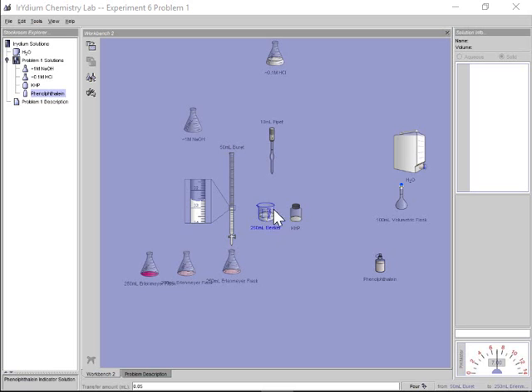Eventually, when you're satisfied that all of this went into the volumetric, you can just add water up to the mark. Be really close when you're up to this narrow neck part here. You would probably use an eyedropper pipette here, because the volume increases really, really quickly. You want to make sure that the bottom of the meniscus is directly matched up with the line. If you accidentally overshoot at this point, you would need to redo it with a new sample, because there's no way of grabbing that powder back out.